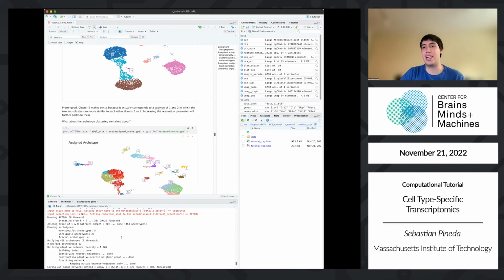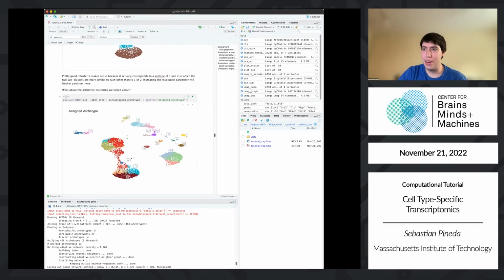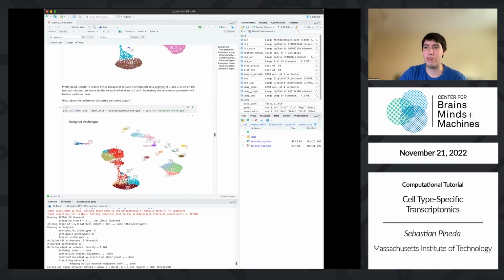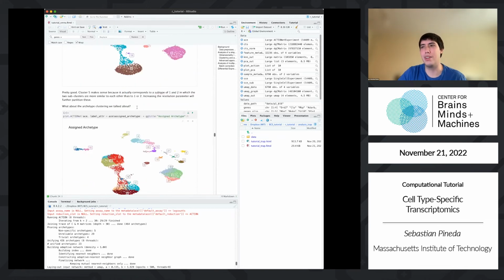And then we don't actually want 464 clusters. What's left is 426. That's still too much to deal with. We can just give it some threshold by which it says, okay, these two are very similar, so all the cells that are most similar to this data point, just pretend like they're part of the same cluster. And this gives us 23 groupings of cells. Now, this is effectively just another clustering, like the Leiden, but notice it looks very different.